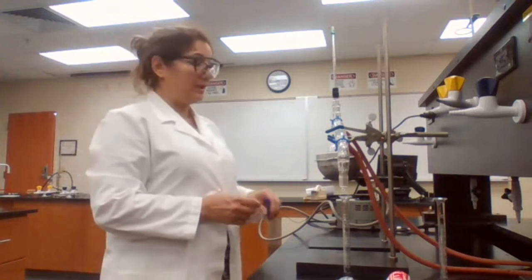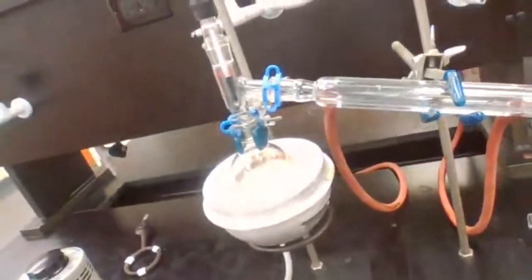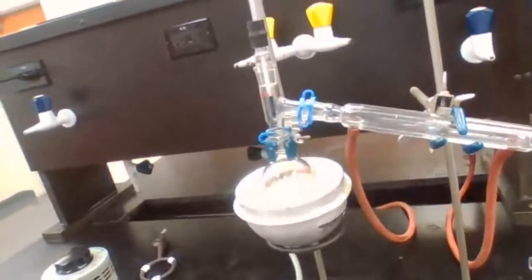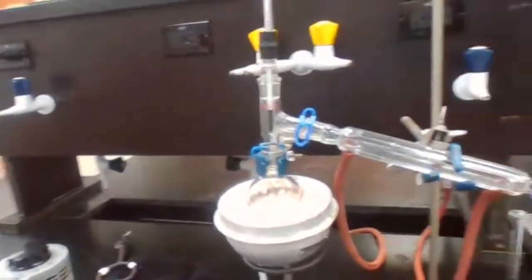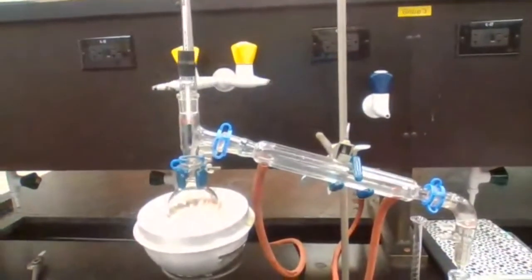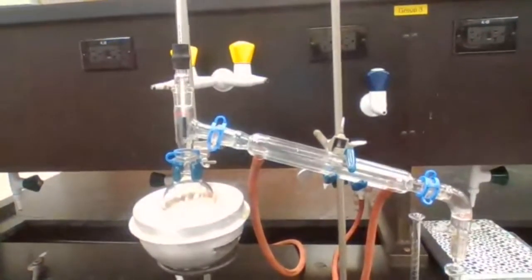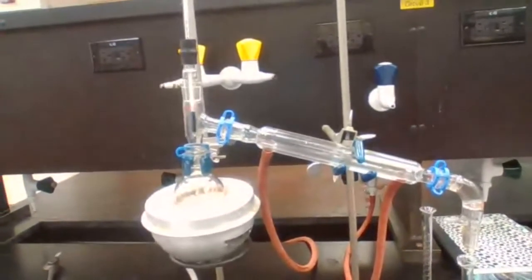The sample is boiling now. I'm going to take the camera and show you. See that the sample is boiling. If you want to take a picture of it, you can use your cell phone to take a picture of the screen or do a screenshot. You can then have that as a reference for how to assemble based on the equipment that we have in this lab.